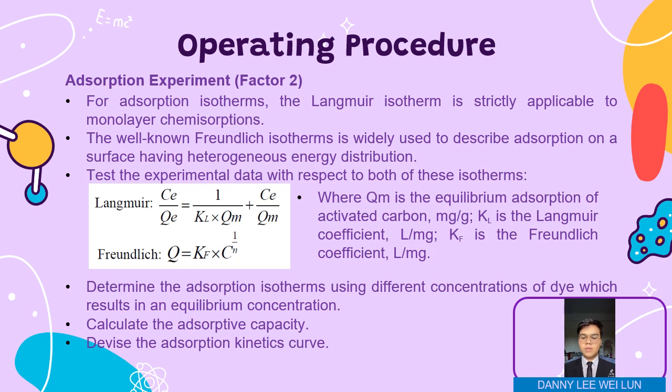Then determine the adsorption isotherms using different concentrations of dye, which results in an equilibrium concentration. Then calculate the adsorptive capacity and also devise the adsorption kinetics curve.